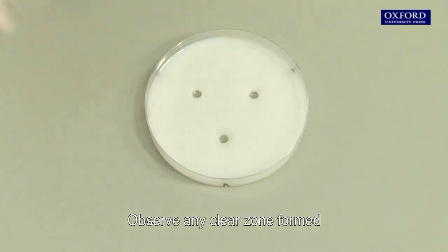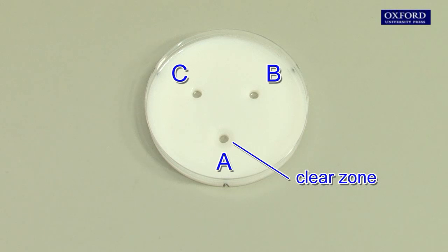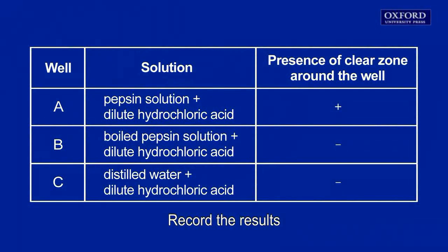Observe any clear zone formed around the wells of the milk agar plate and record the results.